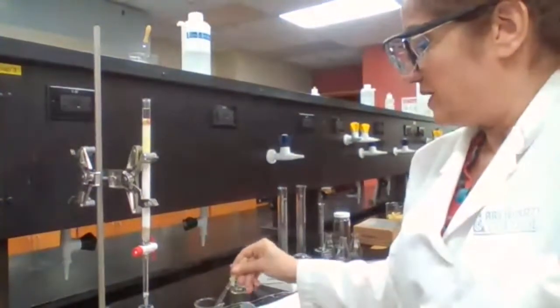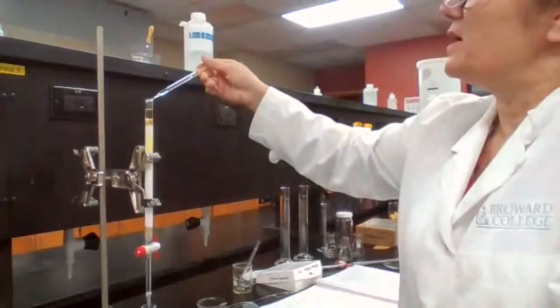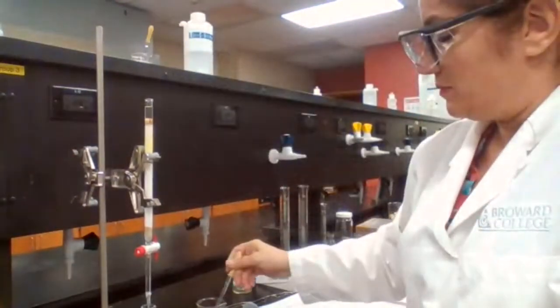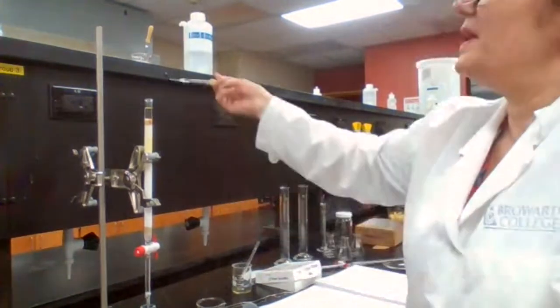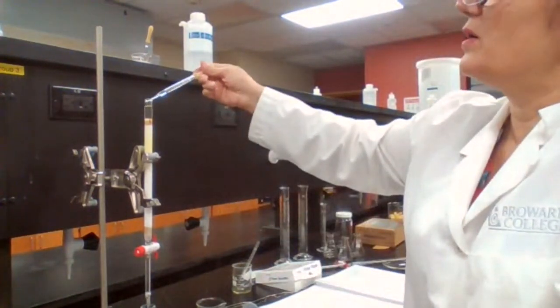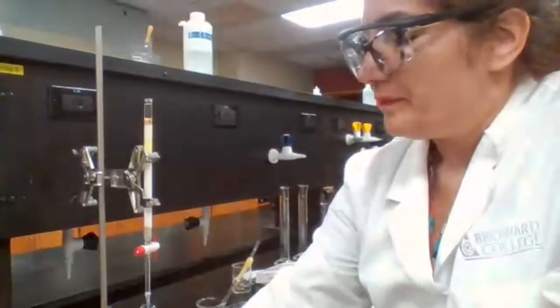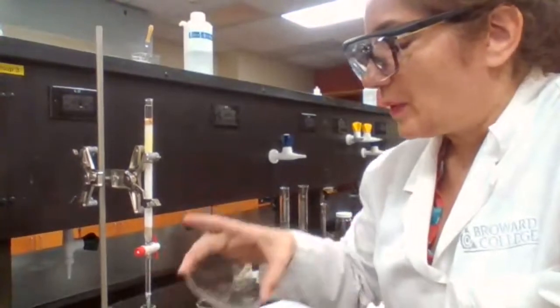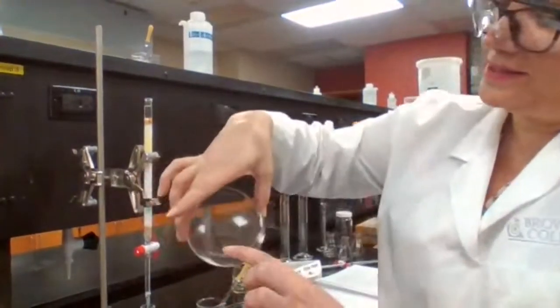You have to be patient with these experiments. They take time, but it's okay as long as you don't leave the chemical that you want, fluorenone, left in the column. You collect it all. This is the only way you can find out: by testing the drops.